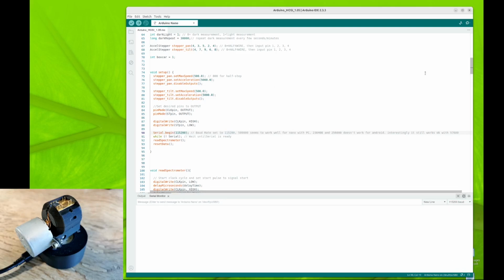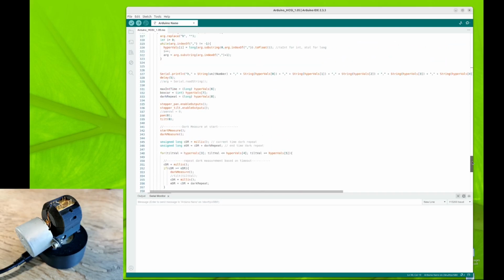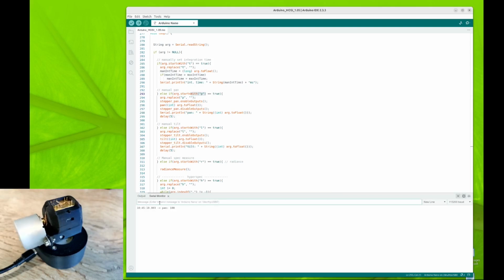And now there are a few functions we can use just to test the spectrometer, the hyperspectral camera, and see if it's working. So here, for example, if we go down to the bottom of the code, there are the functions to do different things that we can specify just with the serial commands. So if it detects something in the serial port beginning with a T, it thinks that this is setting the integration time manually. We can start it with a P, and that means manual panning. So let's do this. So if I go P100, the unit, you see, it's just moved to a new position. And if I tell it to go back, P0, it will go back to where it was.